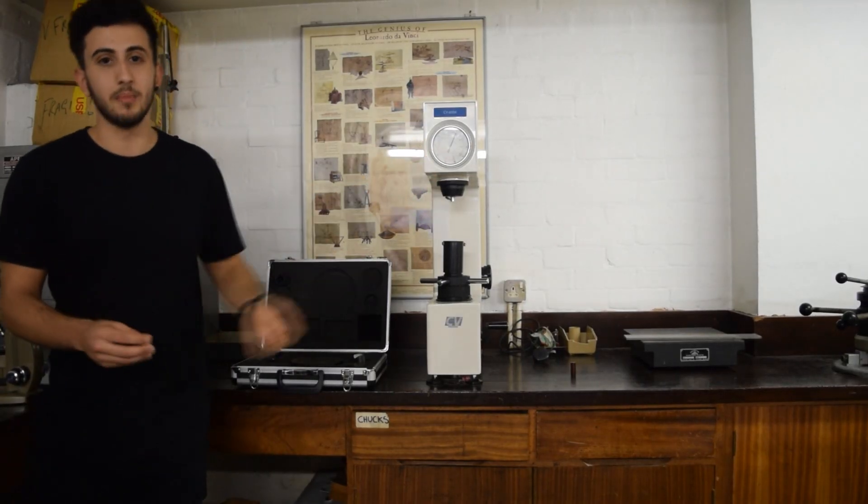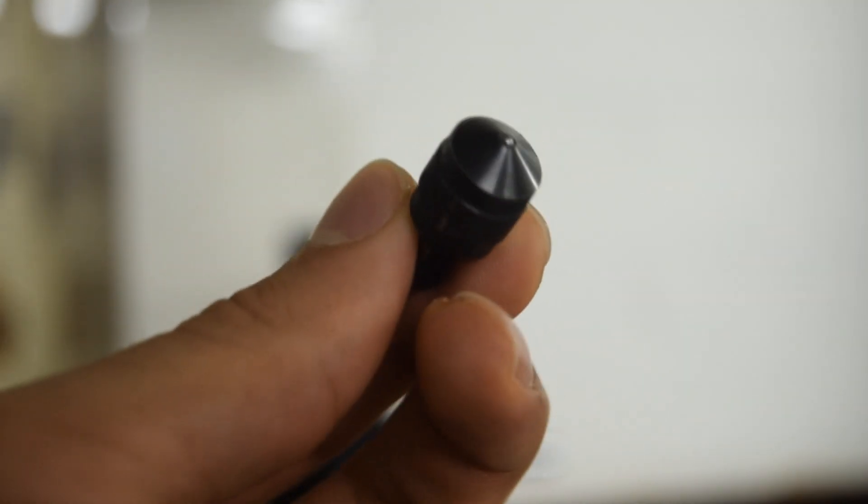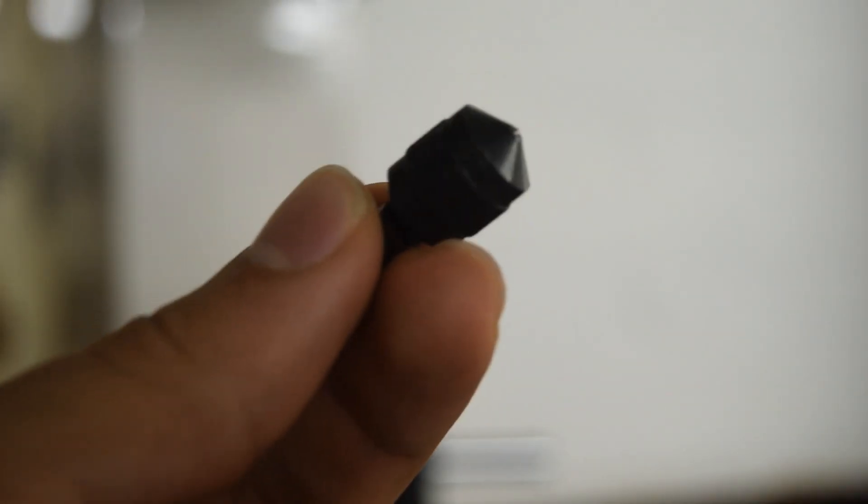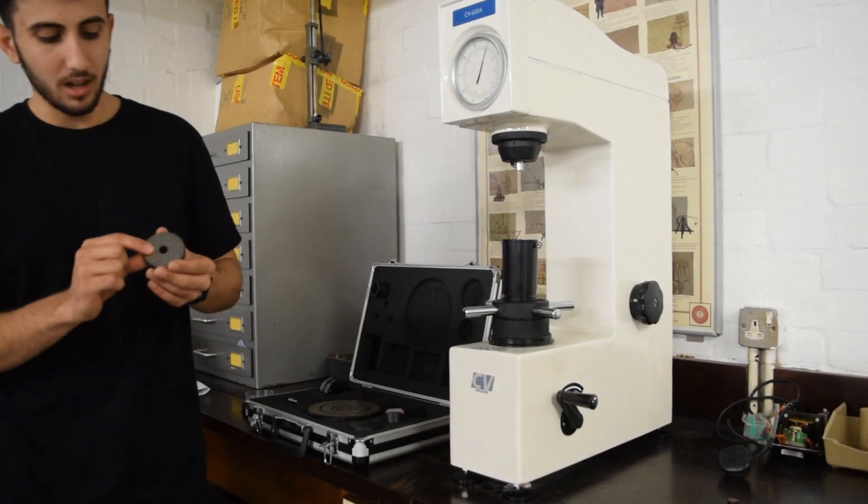Whereas Scale B measures aluminium, alloys, copper, manganal, and cast iron. That one uses a steel ball indenter.